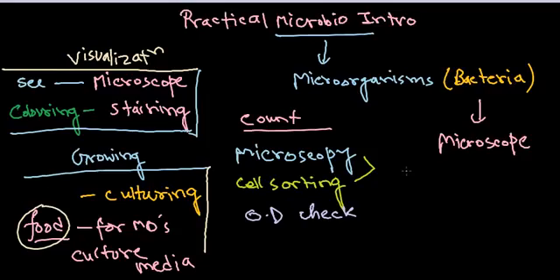So you need to go against contamination, right? So you need to exclude unnecessary ones. You need to pick only those microorganisms you require to work with, right? So that's the most challenging part about microbiology for culturing bacteria and other microorganisms in the lab.